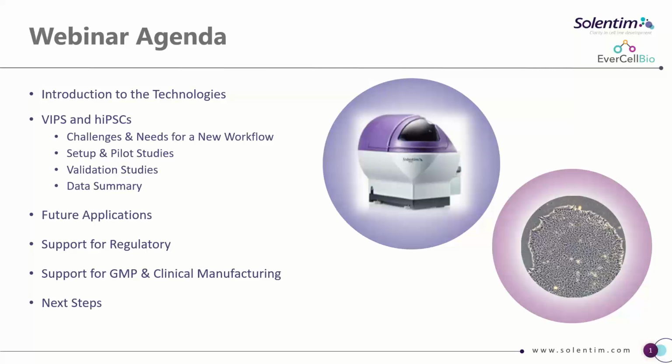Right. Thank you very much for the introduction. I'm going to just set out what the agenda for today is, first of all. So I'm going to briefly introduce the technologies, the platform that we're going to talk about, and then I shall hand over to our main speaker of the day, Phil Manos, who will talk about his work he's done using the VIPS instrumentation with a range of human-induced pluripotent stem cells. Phil will set out some of the general challenges in the field for working with iPSCs. He'll then take us through the optimization steps that he developed working with a cell line to optimize the VIPS and take it through the whole process.